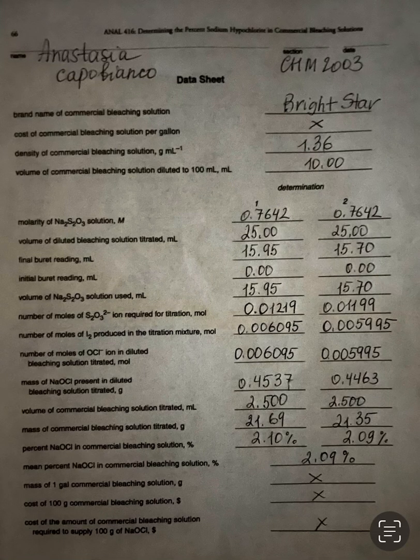Okay, so let's take a look at our calculations for the lab called finding the percent of sodium hypochlorite in bleach solution. So please take a look at what I'm showing to you. This is just an example of how I did it. These numbers are something that I created, but if you take a closer look at the numbers, they're very similar to the ones that you collected. So let's look at every single step by step.